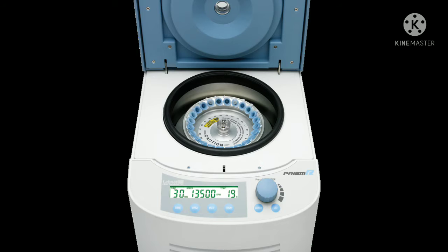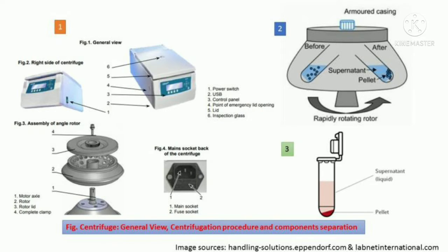There is another question that I want to ask you: do you know what the purpose of a centrifugation machine in a blood sample is? In laboratories, we perform biochemical analysis on body fluids. Centrifuges are routinely used to separate blood cells from serum or plasma, to separate sediment from urine, to measure the volume fraction of erythrocytes in blood, also known as the hematocrit, and to separate bound from free components in protein. So this is mostly what centrifugation is used for.